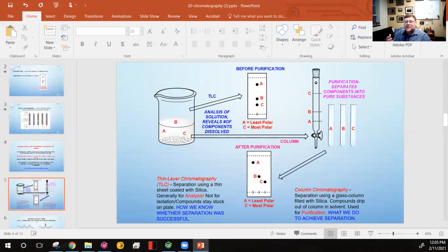All right. So the way this experiment's going to go is we're going to use Excedrin. We used aspirin last week. We're going to use Excedrin this time, and Excedrin's got aspirin and caffeine in it. Good stuff. You're going to analyze it by TLC, just like you did last week. You're going to see the aspirin and the caffeine. And then you're going to do the column, right?